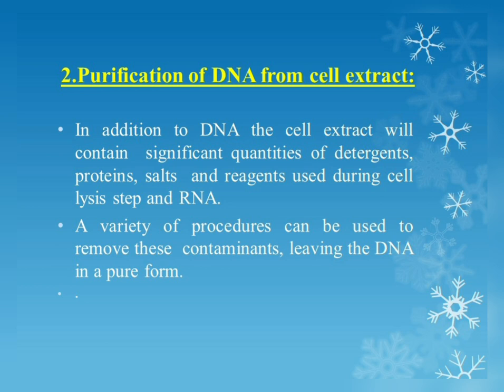In addition to DNA, the cell extract will contain significant quantities of detergent, proteins, salts, reagents used during the cell lysis step, and RNA. A variety of procedures can be used to remove these contaminants, leaving the DNA in pure form. It means various types of procedures are used to remove these contaminants, and they leave the DNA in a pure form.